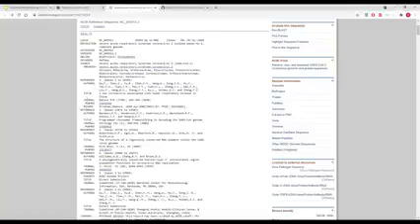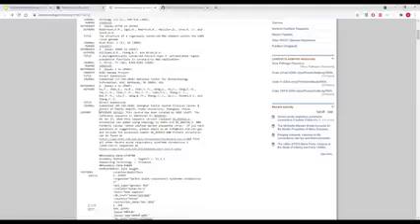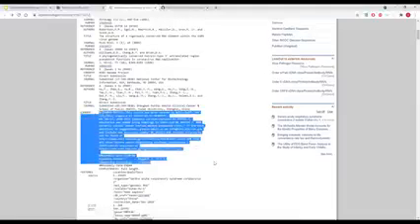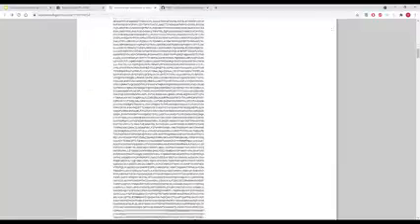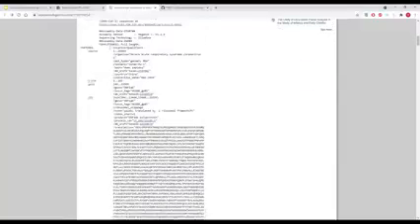So you have the references, authors, title, and so on. Here we have a comment from the NCBI staff themselves about the gene. Then we have the different annotations of features of the gene itself. Let's have a look. The first one here, from base 266 to base 21,555, codes for the ORF1AB gene with this locus tag and this database reference number.